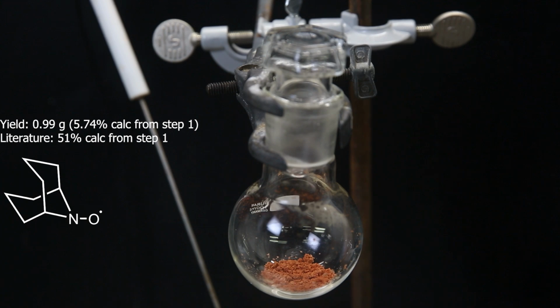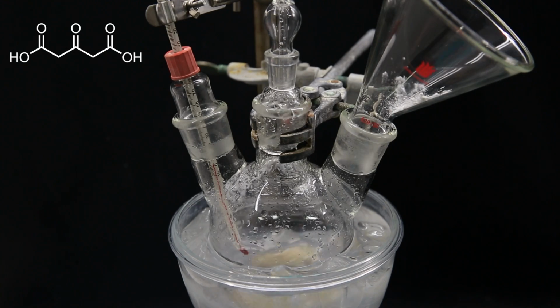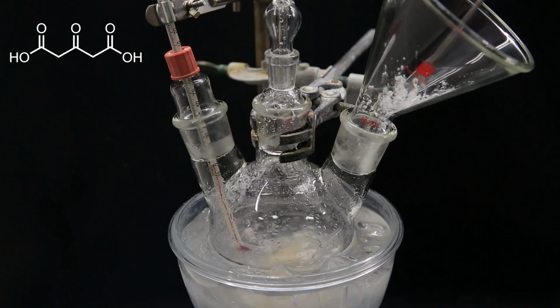If we assume the purity of this product is 100%, then the total yield calculated from the first step is only 5.74%, compared to 51% from the literature. The part where it seemed to lose the most yield was the first step, since the acetone dicarboxylic acid decarboxylates very easily, which might have had an effect.